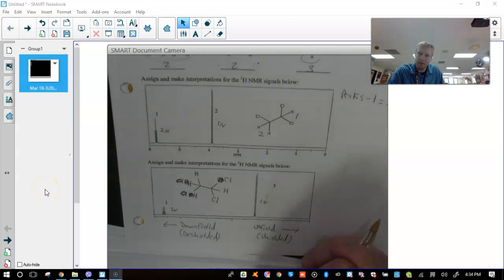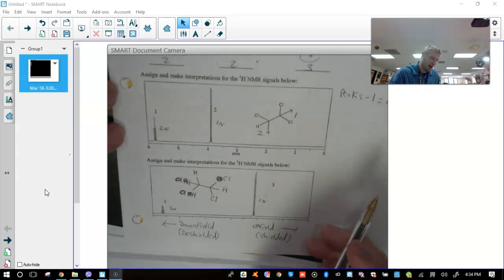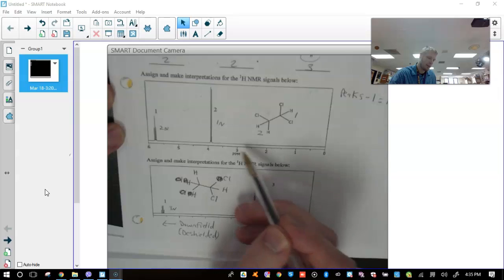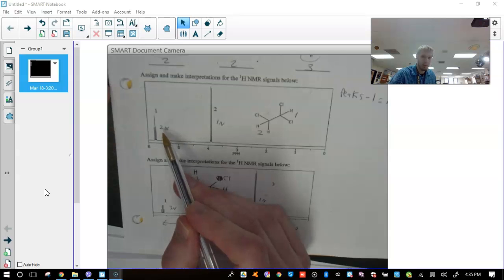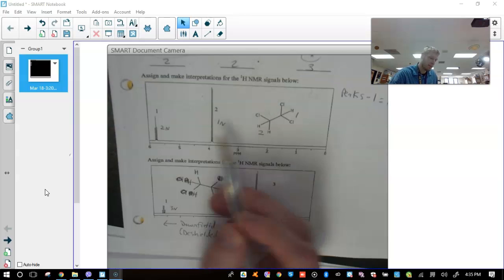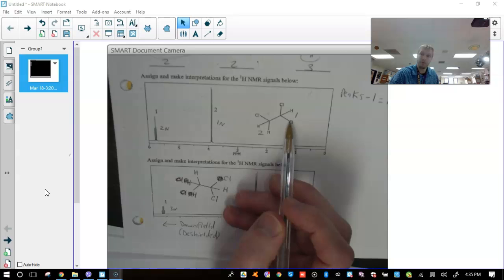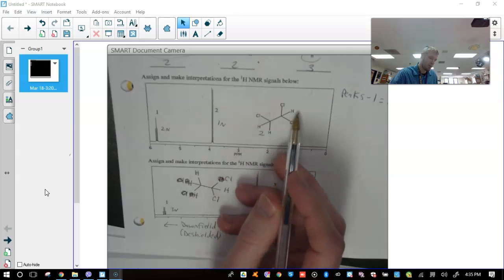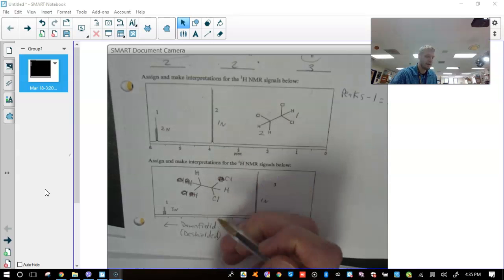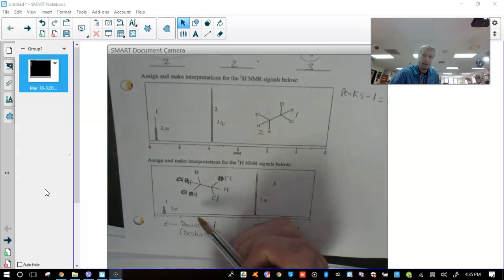Alright, so my video got filled up, so I had to render it and delete some stuff, but here we go. We are talking about downfield and upfield. As we go downfield, we are de-shielding, and this one is a triplet, therefore peaks minus 1 is 2 neighbors. It's next to 2 chlorines, very electronegative entities, therefore they're going to shift this downfield. This one, which has 1 neighbor, is just next to 1 chlorine, so it's still downfield, electronegative, but not as much as the 2 chlorine hydrogen.